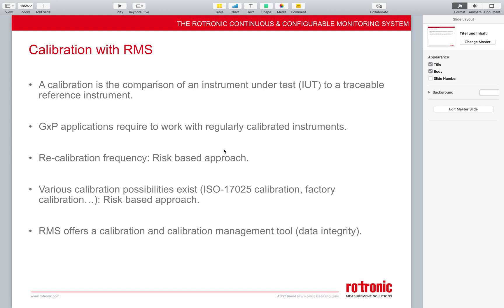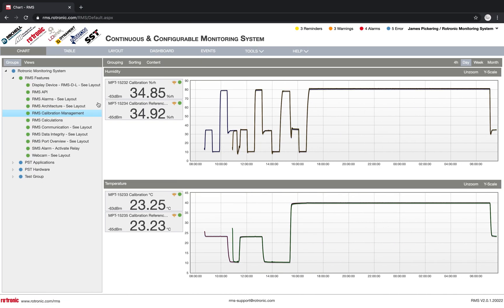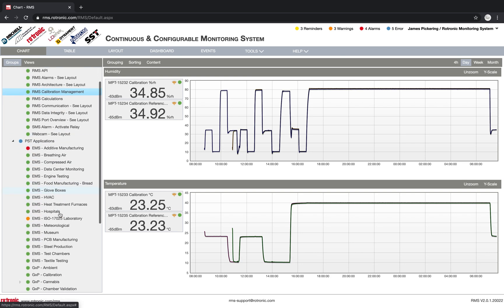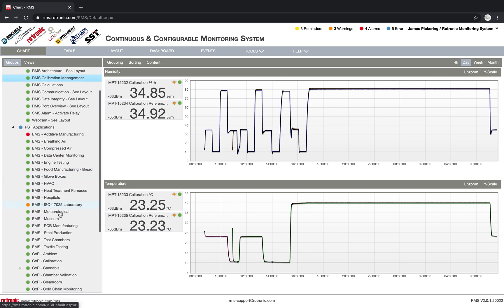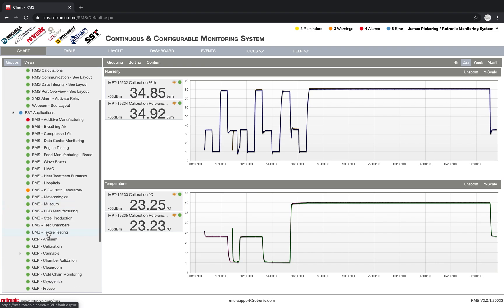We see all of the data and nobody can delete any of this data. So if we look in the system, here I'm already logged in. I'll go into my PST applications and I have down here, I have GXP calibration.